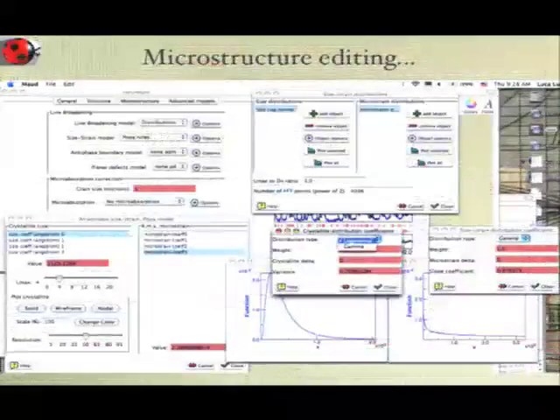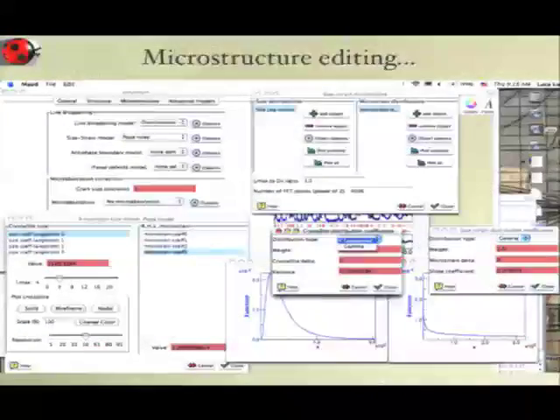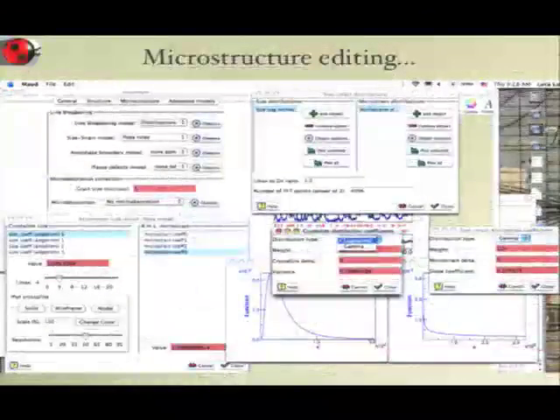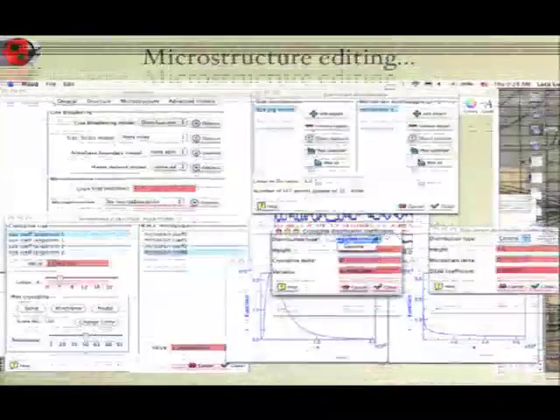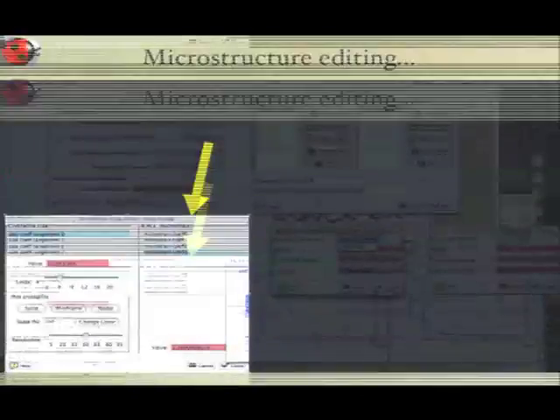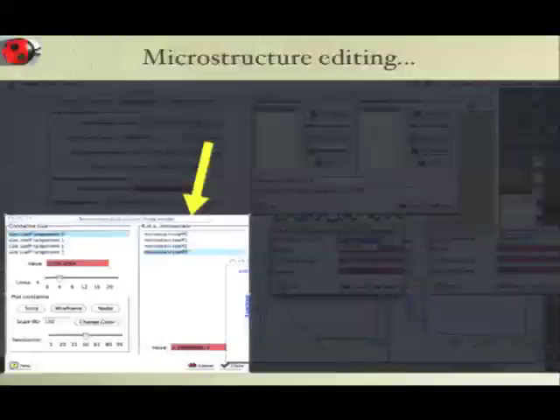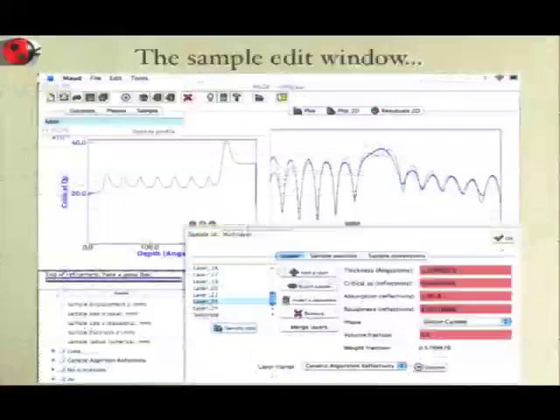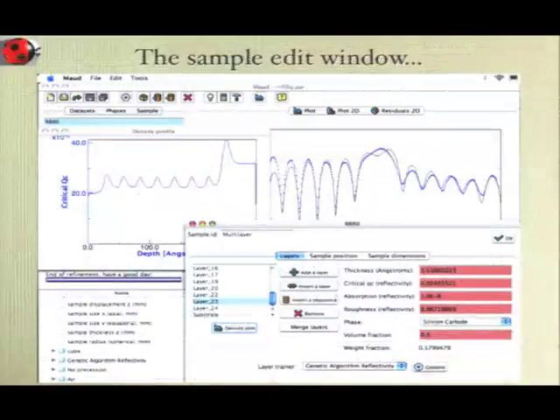So this is the part where you deal with the microstructure. Normally we will see this more in detail. And here you choose the distribution. So you can use a distribution of crystallite size and microstrain to reconstruct the profile. Yeah, this is anisotropic crystallite size and microstrain. You can couple crystallite size and microstrain distribution with anisotropic size-strain, okay? Reflectivity, if someone is interested.